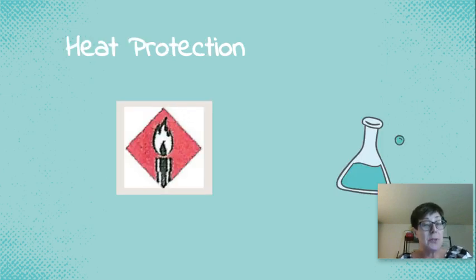Heat protection. This is a Bunsen burner. We will not use Bunsen burners in the middle school. We will use heating elements, but more than likely you'll use these in high school.